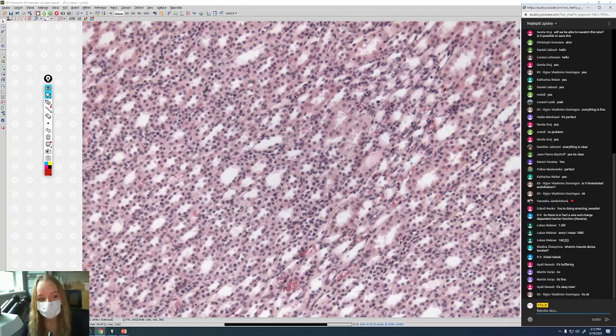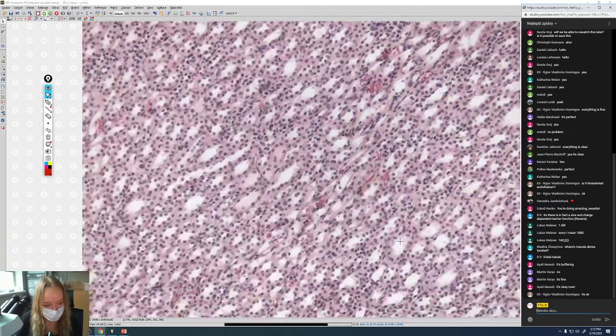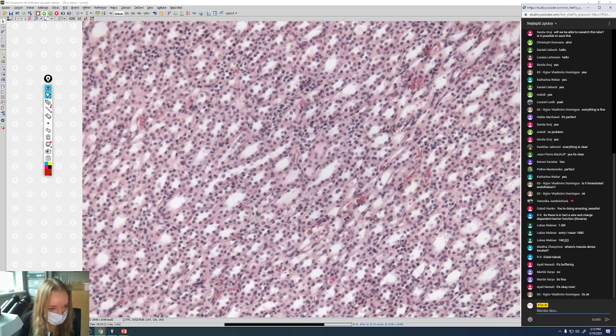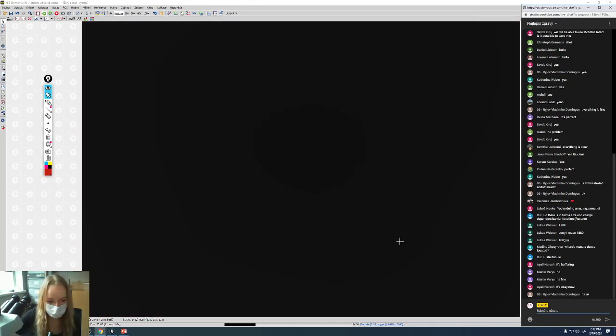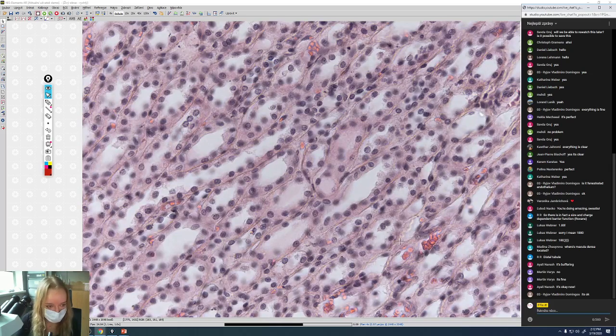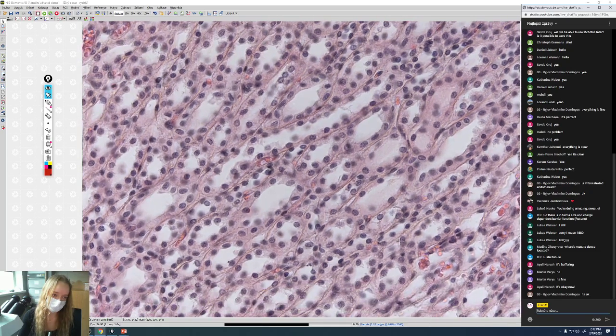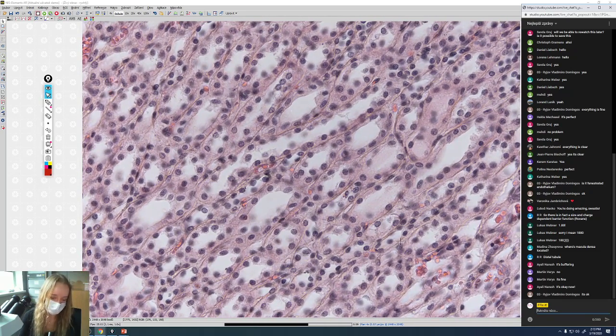I need a little help with this right now. You see, I'm also confused in this part. But first, that's the thin one. Okay, let's focus more. Must be this one. This is the thin one, I can see it right here.